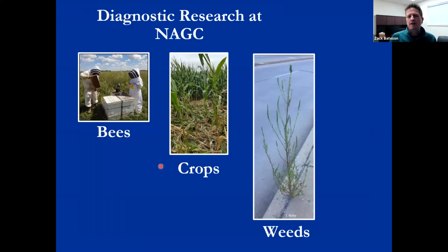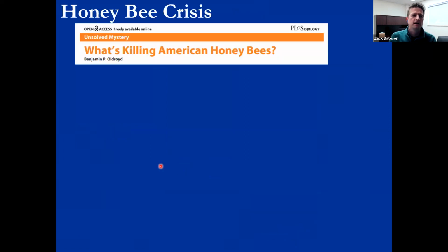So that's a little bit of the background of the technology that we use. I'm sure it's a refresher for a lot of you, but I just wanted to explain that before I jumped into the 3 research projects I wanted to talk about, because they all use PCR and quantitative PCR technology. So I'll be talking about bees, crops, and weed projects.